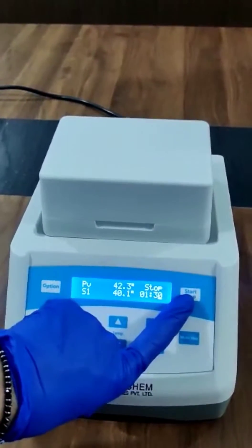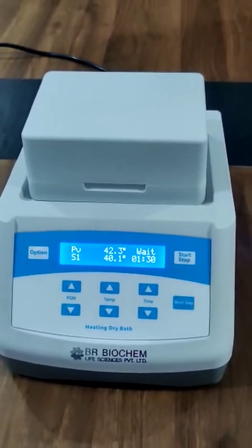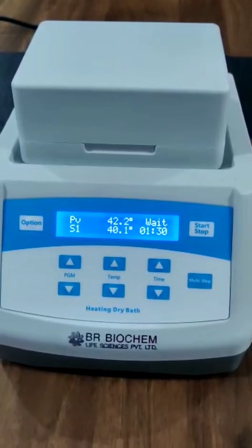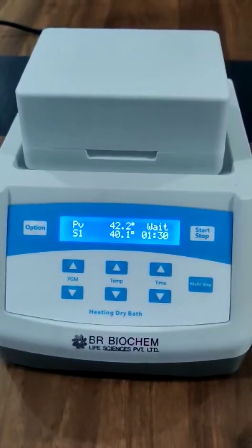Just press this key and wait. Now the incubator starts working.